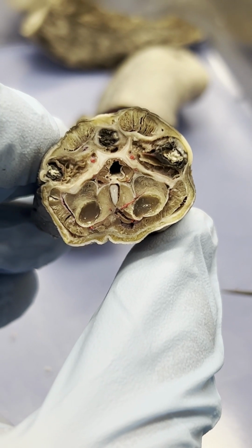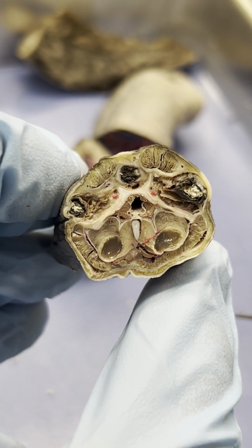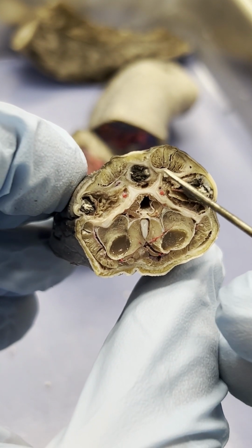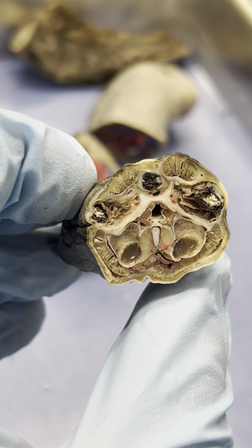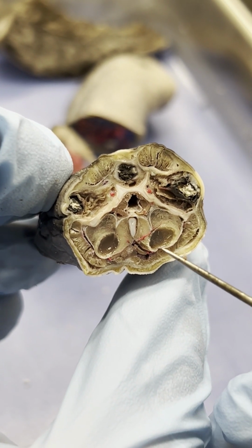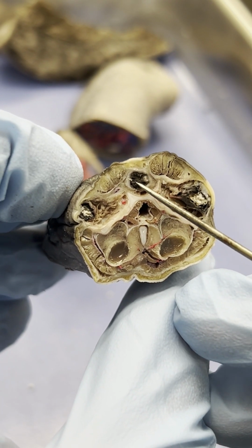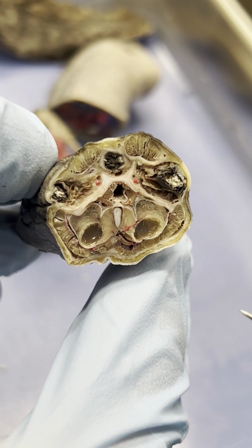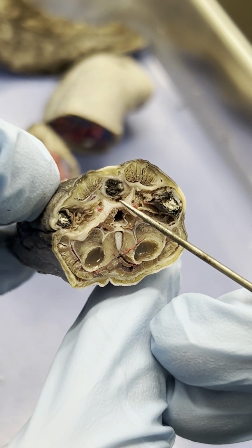Hey guys, here is our last cross-section. This is going to be 3.6A, the pineal gland. Our first structure is actually the pineal gland, which is right up here. The lab manual says pineal organ. I use pineal gland and pineal organ synonymously for whatever it's worth. The next structure we have is our nasal sac, which is going to be right here. Also, keep in mind, the nasal sac is also called the olfactory sac. The next structure is the hypophyseal pouch, which is this opening right here.